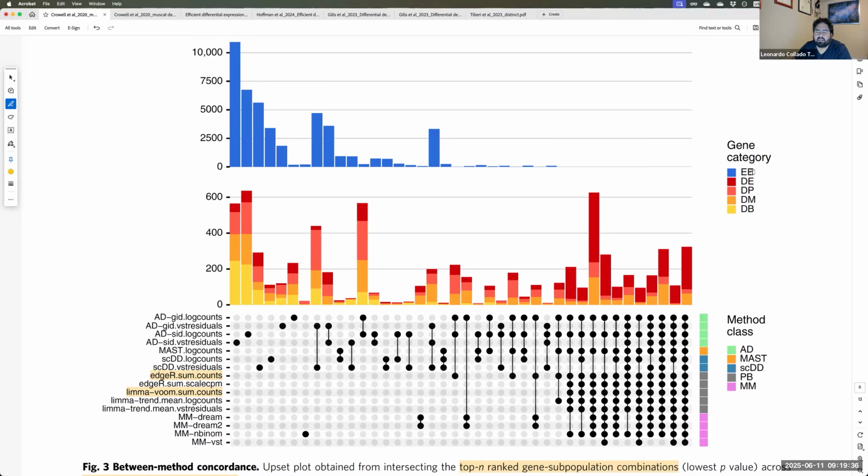So they shouldn't have been detected as differentially expressed. So the blue are basically false positives. So you want your blue bars to be smallest. Then the yellowish two bars, these are the differentially expressed results. The dark red, the actual differentially expressed.